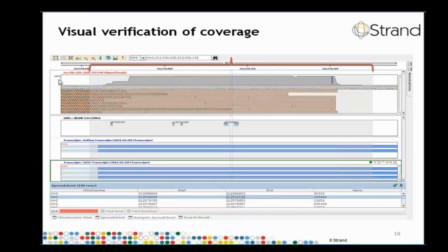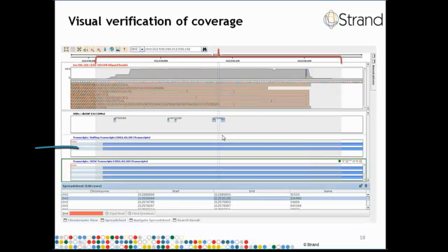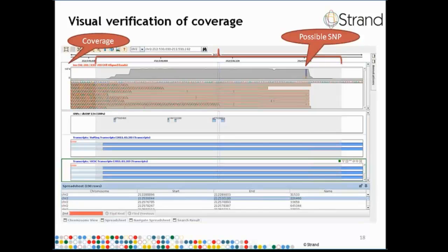You can see the dbSNP information. There are 5 dbSNPs in this particular location. You can see multiple transcript tags. Even though we started our analysis with RefSeq transcripts, you can use the annotations which are there out here in the Genome browser to load other transcript tracks purely for visualization purposes. One can also see a mismatch histogram out here that indicates locations where a substantial number of reads are differing from the reference, and the mismatch histogram gives an indication of what are the possible variant bases out there.